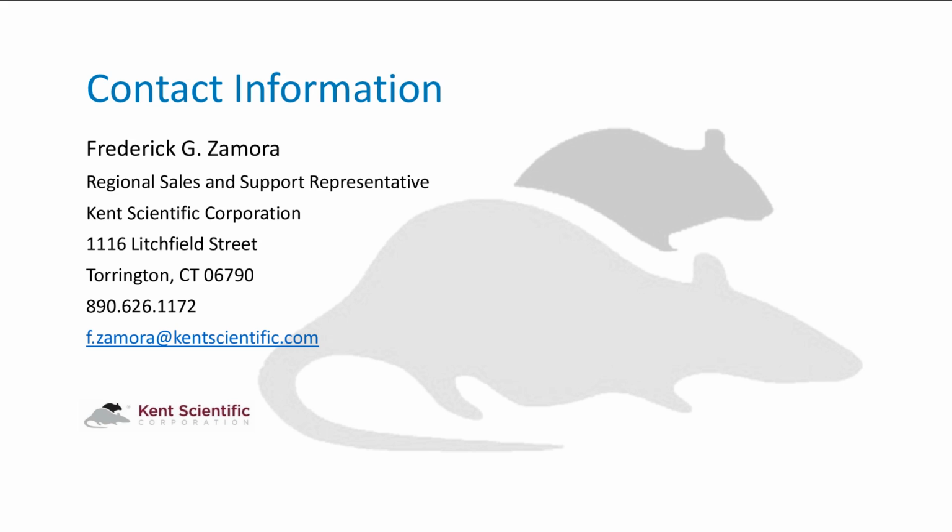Okay, great. Another question here is, how does the flow rate affect the ISO percent needed? High flow rate would need less ISO? Just trying to get my head around it a bit. Yeah, no worries, Mike. Basically, the flow rate doesn't affect the ISO percent needed. As you're adjusting the flow rate, the system will automatically adjust for the percent ISO as well. So if you have it set on 2%, it will stay at 2% no matter what your flow rate is. Okay, perfect.